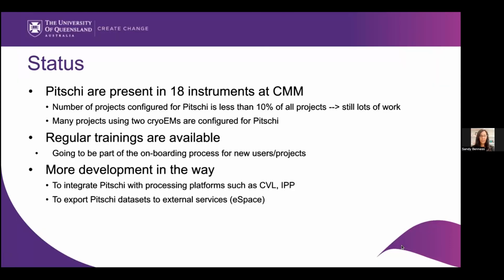Okay. So you use AAF for authentication. If you had a visiting academic from another university using your instrument, would they be able to log into their own institution and use the system? Well, it is actually more complicated than that, because the UQ RDM is a UQ specific thing. So in most cases, we actually ask the visitors to create a UQ account.